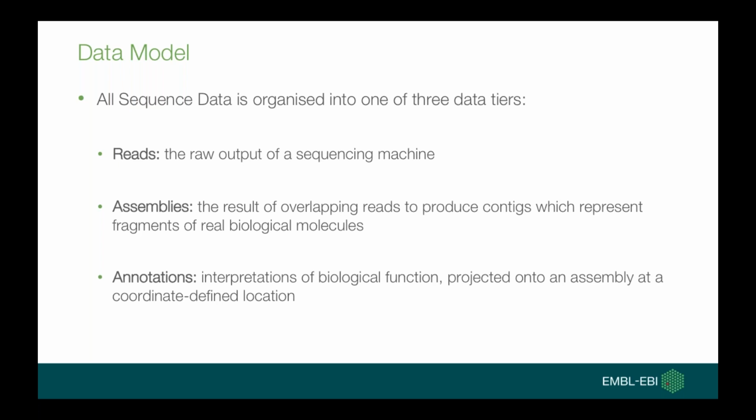You can see this builds on the reads tier directly, and we treat it as different in the database, although there will usually be a relationship between assembly and read data. Building on top of that again is the annotation tier.